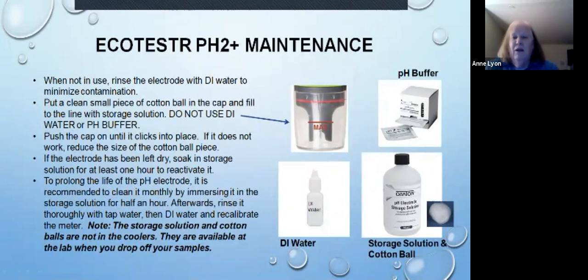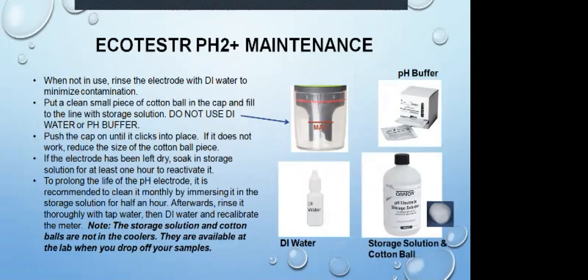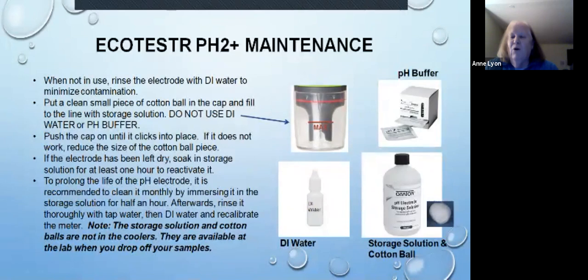do. Essentially, you'll pull the cap off, you'll pull out the old cotton ball, you'll thoroughly rinse this with DI water, you'll put in a new cotton ball, which we found that about 1/3 of the size of this cotton ball works. But you want to be able to get the cap to snap back into position. And then you're going to fill this up, usually just to about here, because that tip is going to displace it, and you don't want it all the way up here, because that increases the chance that you might have some leaks coming out of your cap if you get much above the max line.